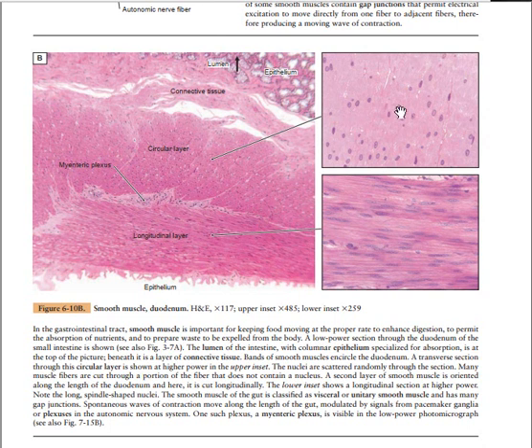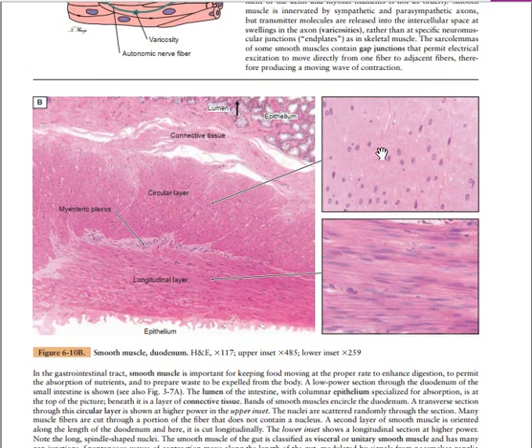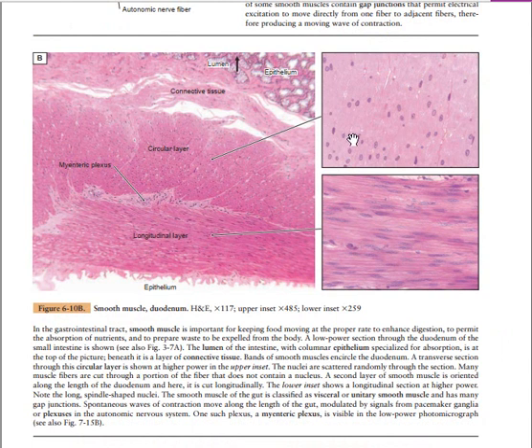For the circular muscles, this section can be seen. For the longitudinal muscles, this section can be seen, and you can visualize here that these muscles are not even striated, so they have only one nucleus. This is the cross section. It is circular at the center, but here you see it is much more spindle-shaped.